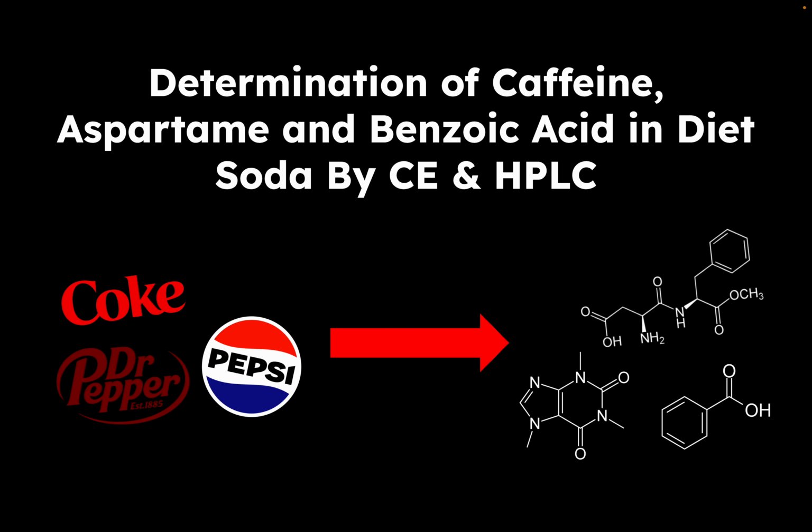Otherwise, this is just to get an idea of the kind of pacing that I'm going to have when I give this presentation in front of my instrumental class.